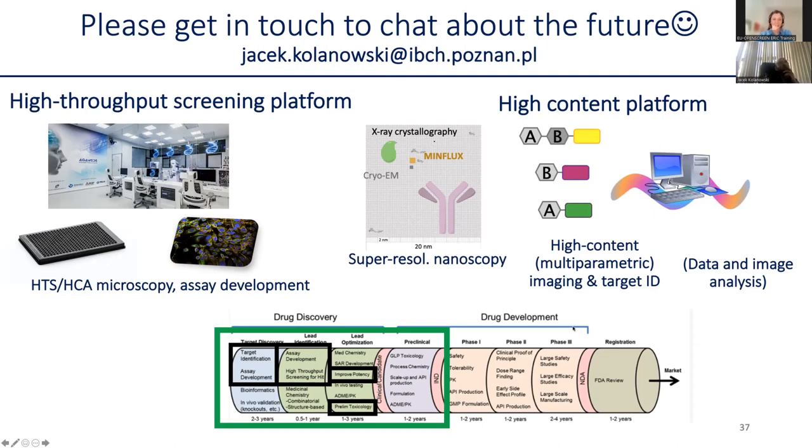Okay, let's start with the first question from our participants, which says: genetically modified bioluminescent pathogens have been designed and monitored both in vivo and in vitro in the presence and absence of therapies to test their effectiveness. How do you see specifically the future of fungi for these purposes? The fungi as a potentially a pathogen? Yeah, exactly.